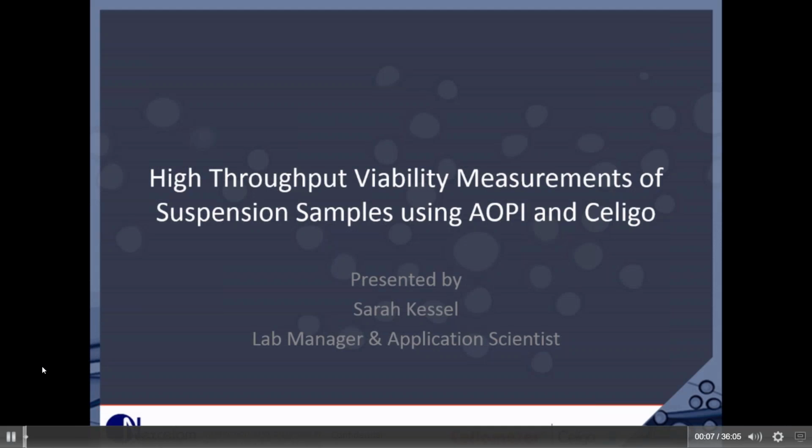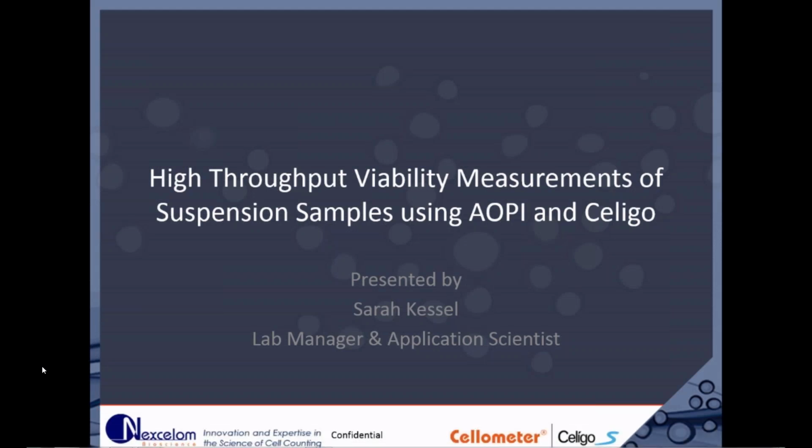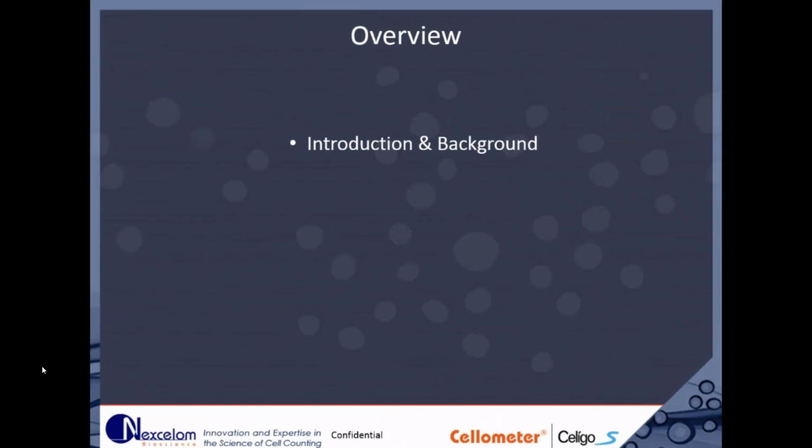This webinar is pushing some next generation stuff, moving from single cell sampling into a more high throughput method on Celigo. So first, I'll give you an overview.